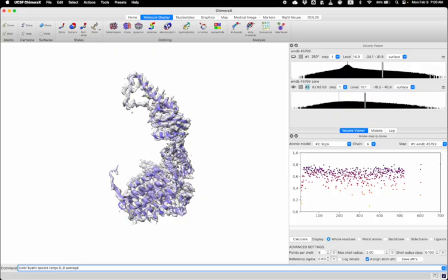And then I will enter average residue. So this average is the Q-scores of all the atoms in each residue. And then I want to generate a color key, so I say key true, palette, and then I want to change the palette so I know what I'm displaying. So I will go from red to a blue. I'm going to use a softer blue, since the default blue is a little dark, so I'm going to put in the RGB values, 0.4, 0.4, 0.9, so this makes the blue a little bit softer.